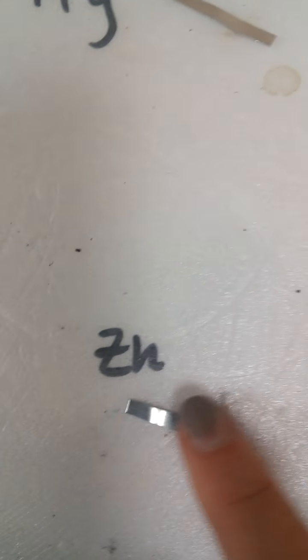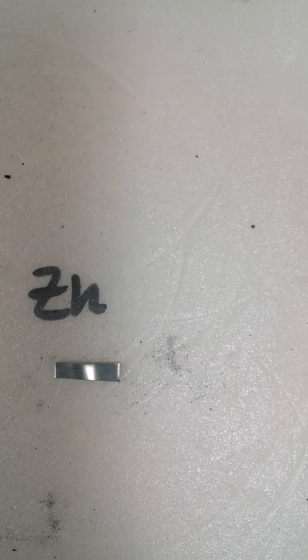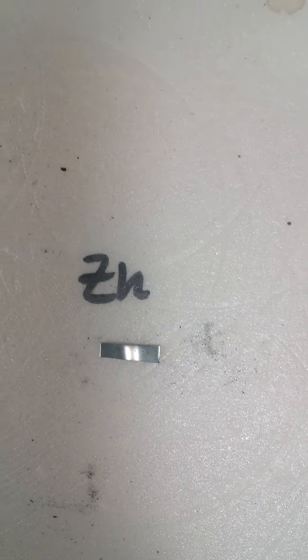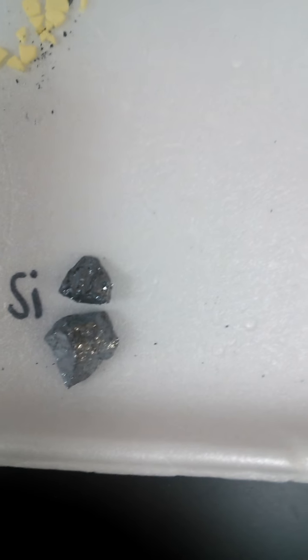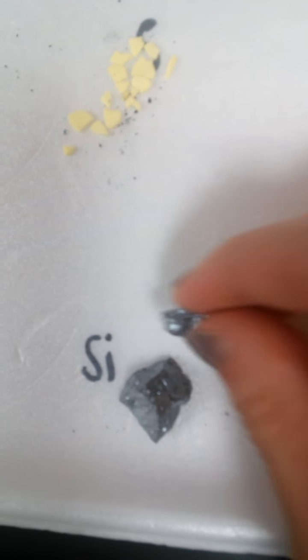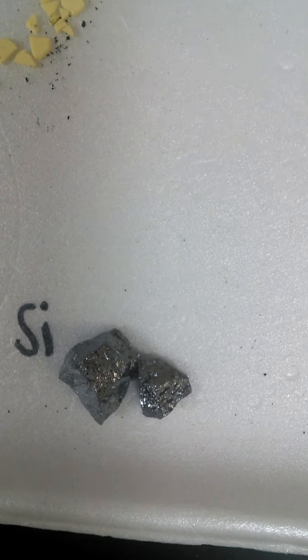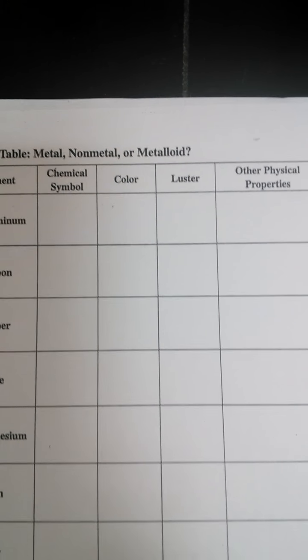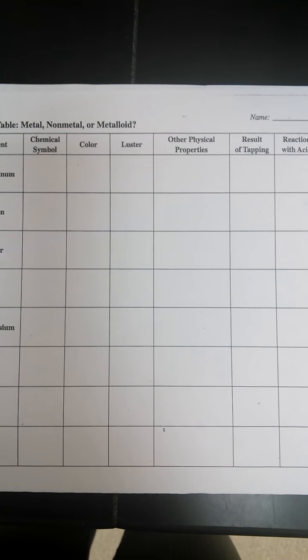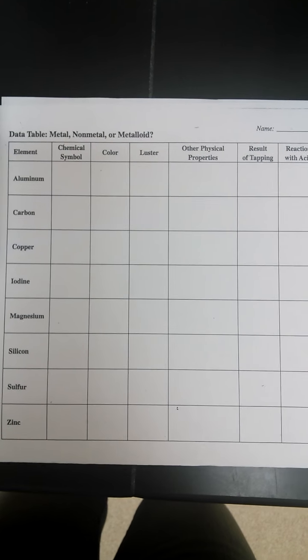Then we have zinc, which is a silvery, shiny color. It should be malleable and ductile. And then our last element is silicon. And it's not malleable or ductile because it is easily breakable, but the color is shiny. It's like a dark, shiny gray. So there you can fill out the first couple of columns of your sheet right here.